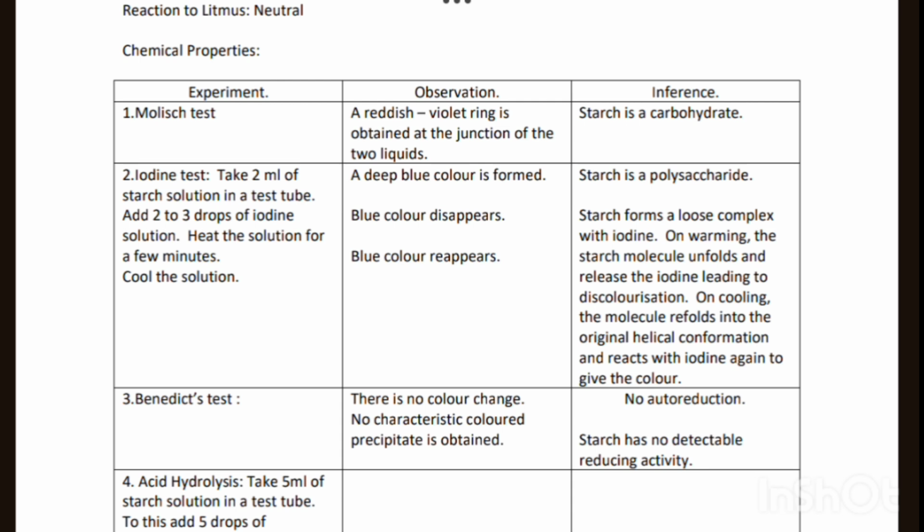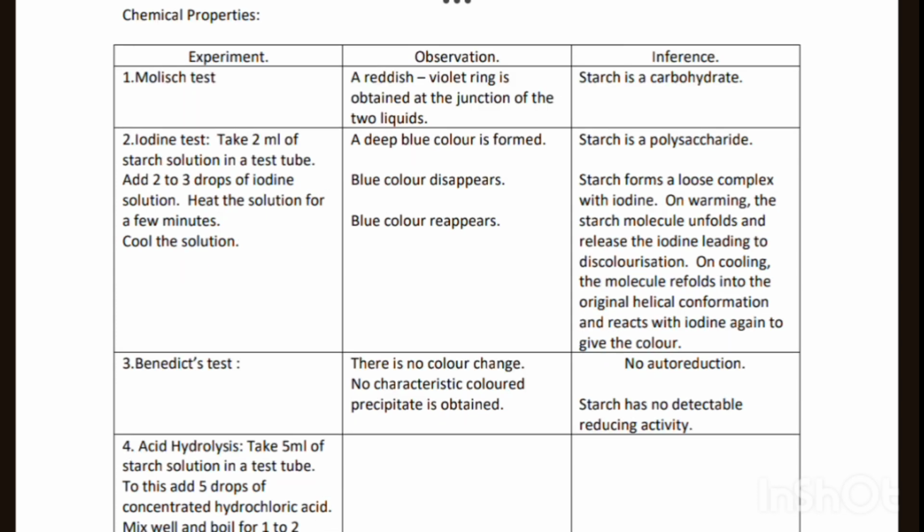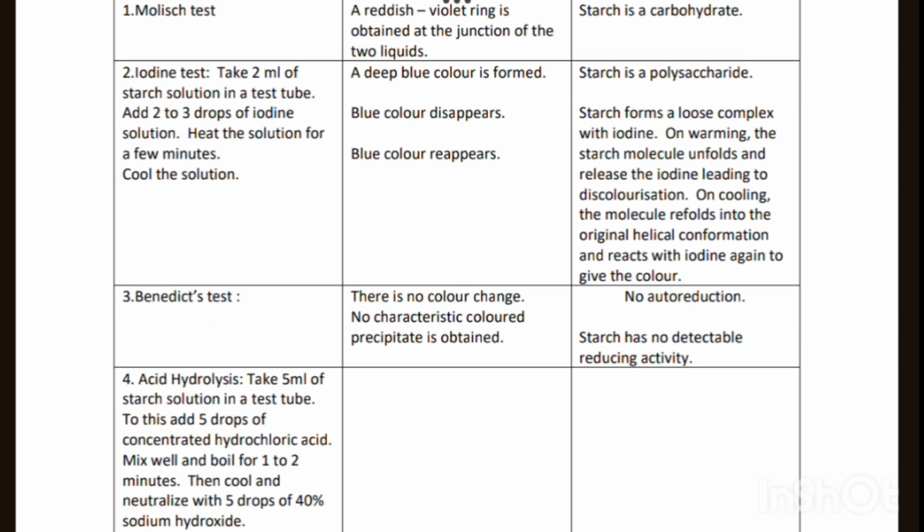Now when you heat the solution, this blue color disappears. But when you cool it, this blue color reappears. It's not magic, it's just reagents and sugars. Starch forms a loose complex with iodine, and when you heat it, the starch molecules unfold. You know it has that helical structure, right? So this unfolds and releases the iodine, leading to decolorization. On cooling, the molecules refold into the original helical conformation and react with iodine again to give the color.